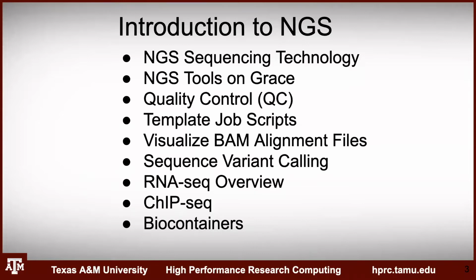We're also going to be analyzing some BAM alignment files. We'll be doing that both in the terminal and then on the portal with IGV and SAMtools tview. We'll be briefly covering sequence variant calling, some of the tools there, as well as a brief overview of RNA-seq and ChIP-seq. And then we're going to end by looking at biocontainers.